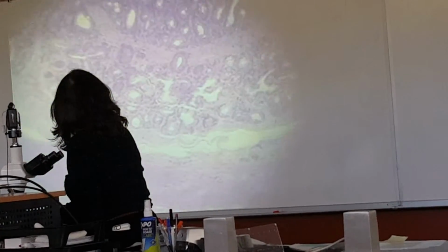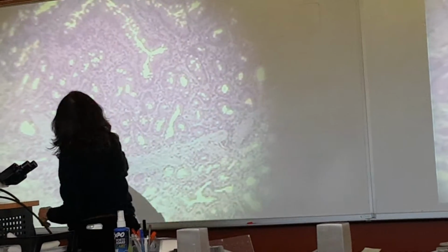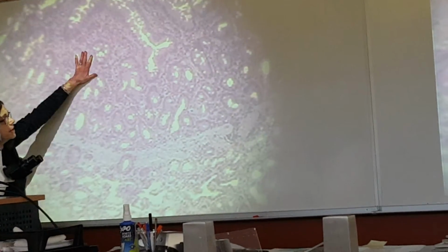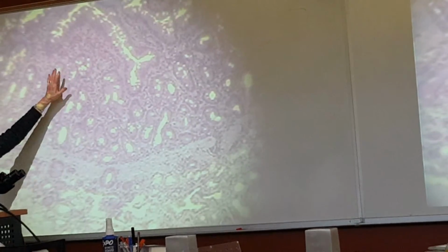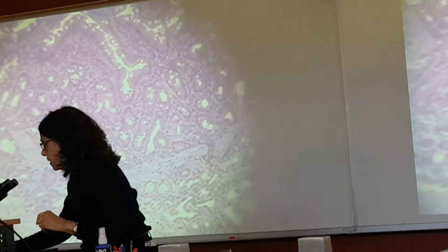So that's why they have two different orientations for the two different types of muscle layers we're looking at. Okay, so this is a very nice one for the, now you can see the smooth muscle, muscularis mucosae, that separates the mucosa from the submucosa. The last thing I want to show you on the slide, I want to look at the villi under the next power and see if we can see microvilli.